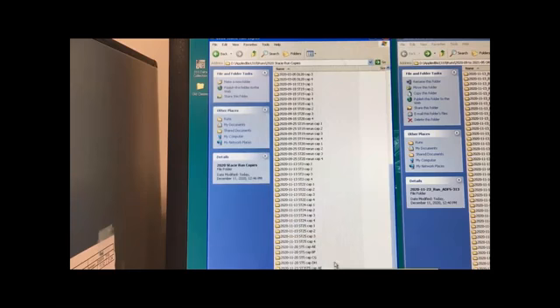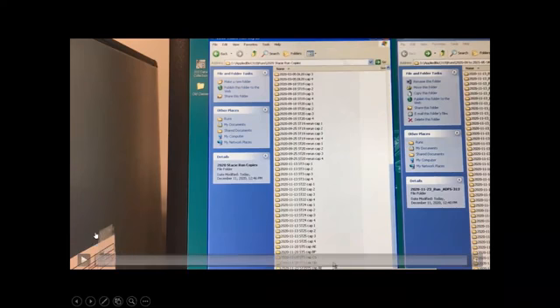So this is kind of complicated. I promise after you go through this a couple times, it'll get a lot easier, and I'm going to write out these directions so you can follow it. But sometimes watching this video, especially when the directions are about copy and paste and Control A, I think just having this short video, watching it once, hopefully will help you out a lot. And then after this, I think that's it.